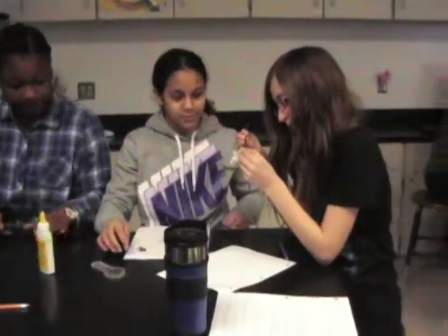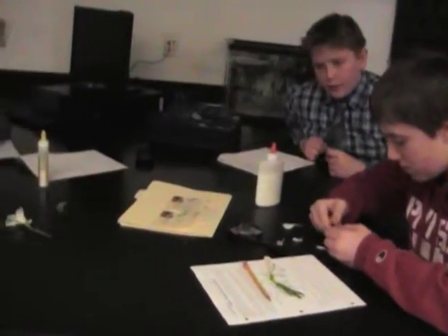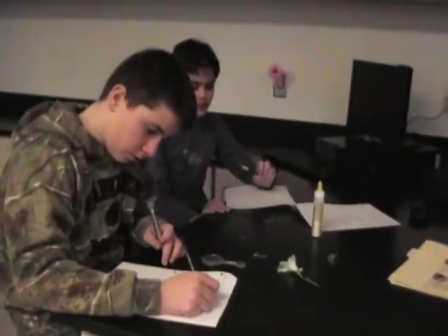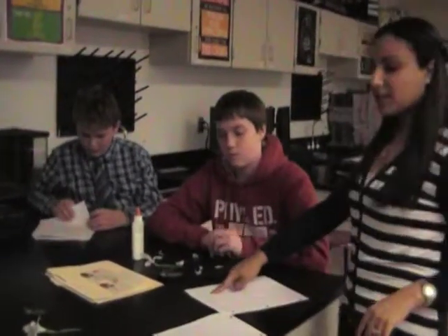Identify the petals. There's 3 sepals. Are you following the procedure? We've got 5 in ours. It's a flower part that elevates the anther. Alright, you haven't filled anything out for this. Locate the outermost, these are sepals, remove them. Record the number and describe the function in your data table. So we're going to go to our data table on page 2. Record the number of sepals, attach one here, and describe its function.